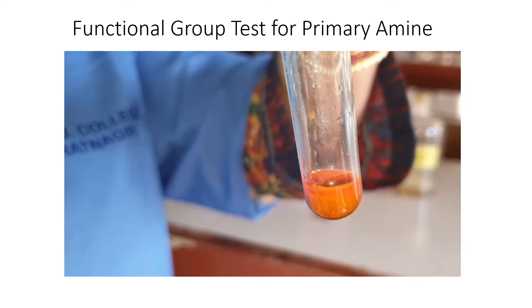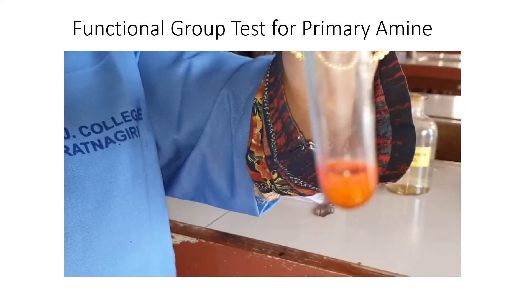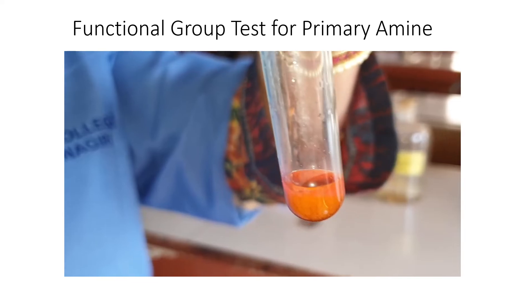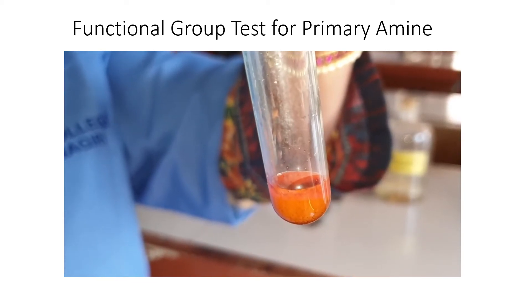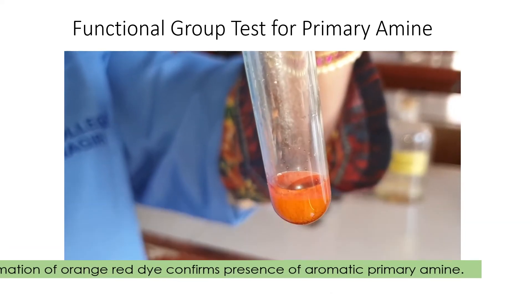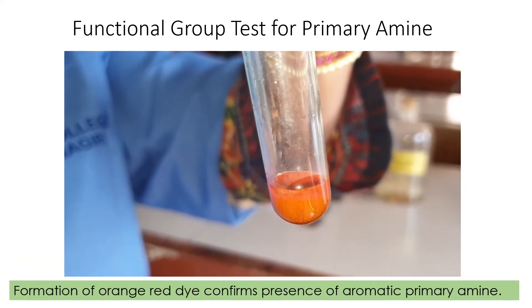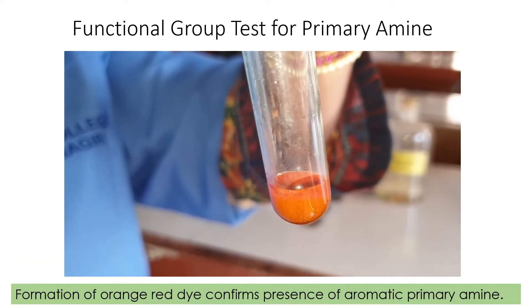As you can see, in this case we have obtained an orange-red dye. Formation of an orange-red dye confirms the presence of an aromatic primary amine.